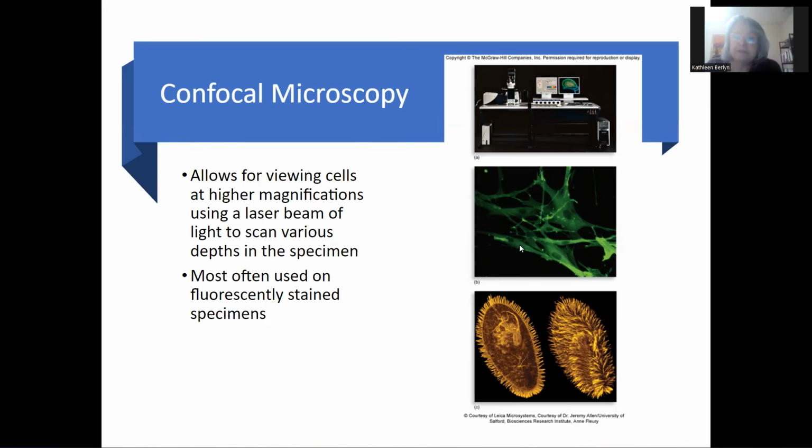And then what happens is you use a computer with the microscope, and you take a series of images and stack them. So if you think about when you look at the microscope, we talk about depth of field, and you notice when you tweak the fine focus, things move in and out of focus.